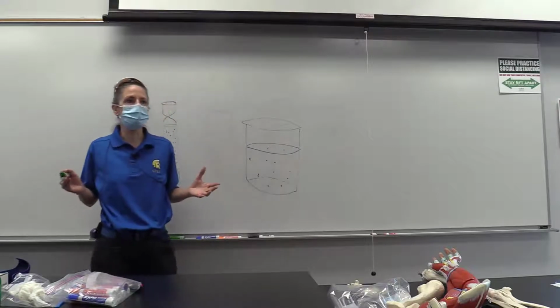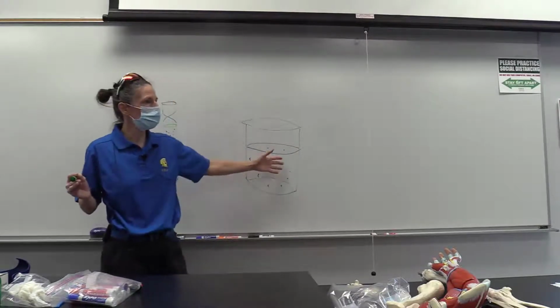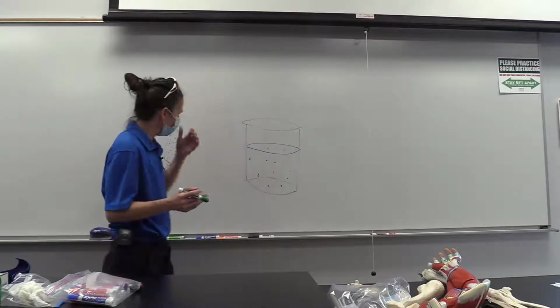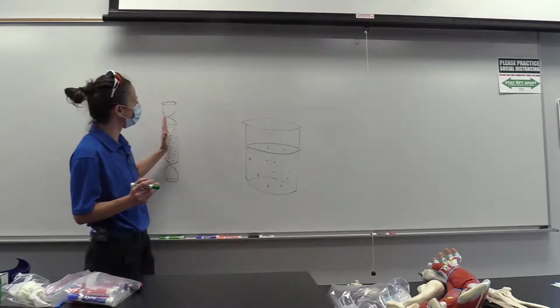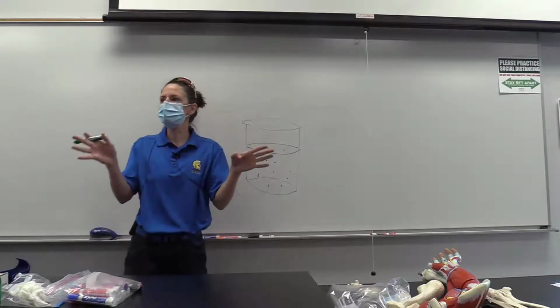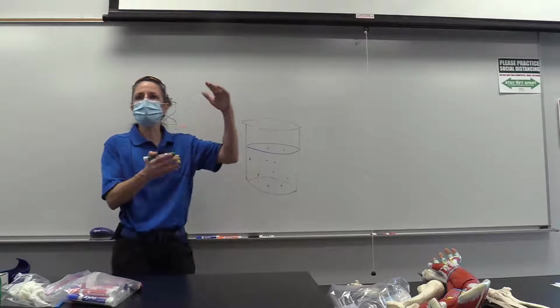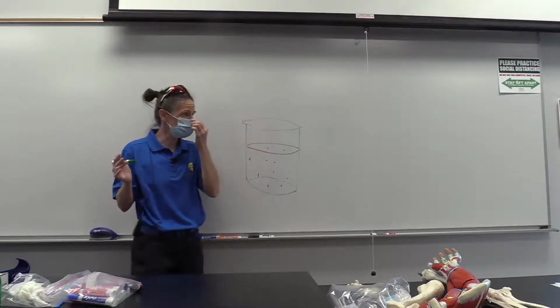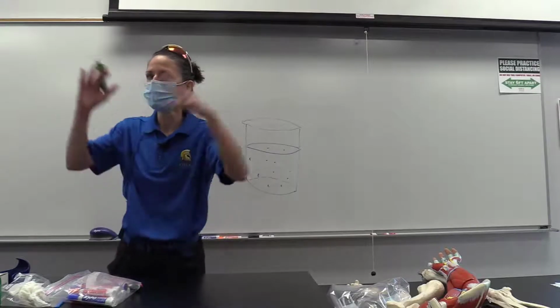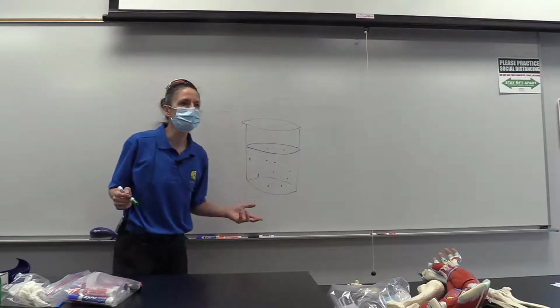What happened to the beaker after the hour? What happened to the water in the beaker? It changed color to blue. And so we had a very rich blue color in the dialysis tubing to start out with. Some of that dye diffused out into the beaker. If you left it long enough and let it diffuse long enough, then they'd be about equal in color on either side because the solution would be uniformly mixed.